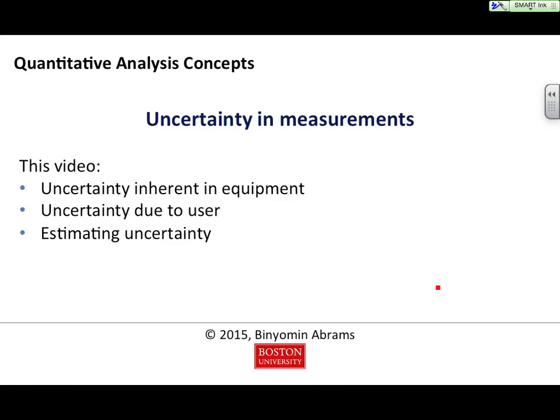In this video, we're going to talk about uncertainty in measurements and how that uncertainty is related to the equipment, the person using the equipment, and other factors. Our choice in equipment is usually based on the accuracy and precision of the equipment.